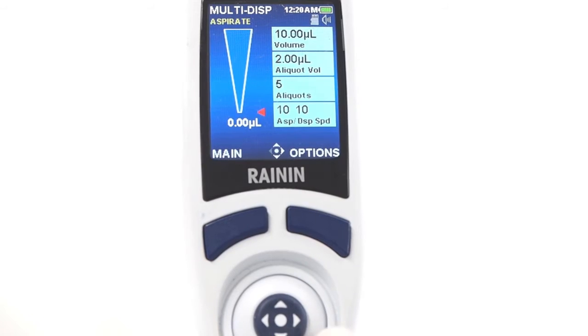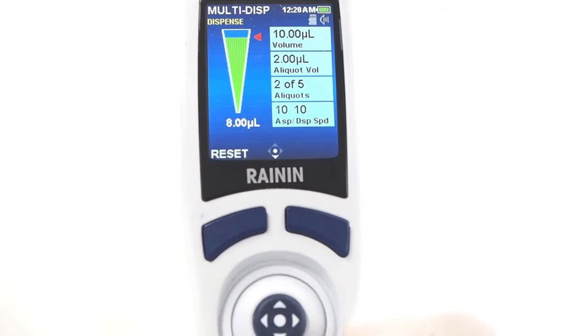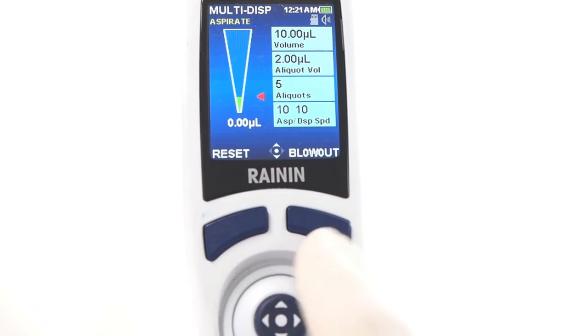To manually multi-dispense, tap the joystick up to aspirate. Tap down to dispense each aliquot, and blow out when done.